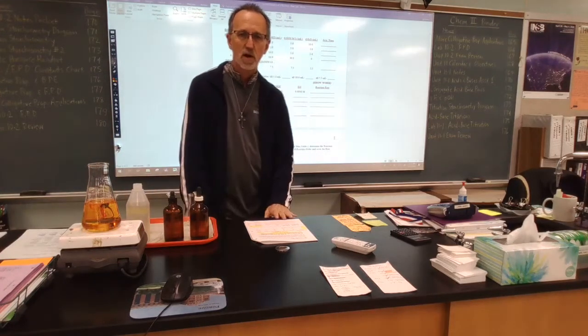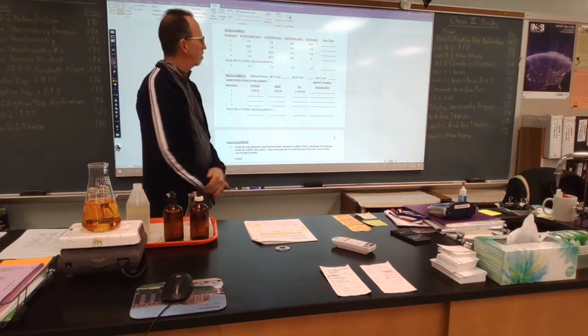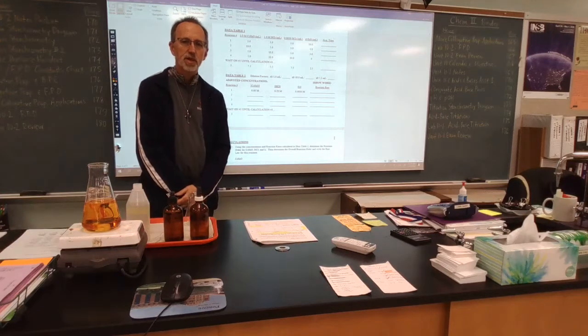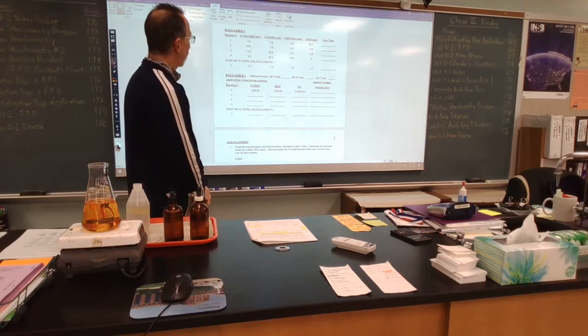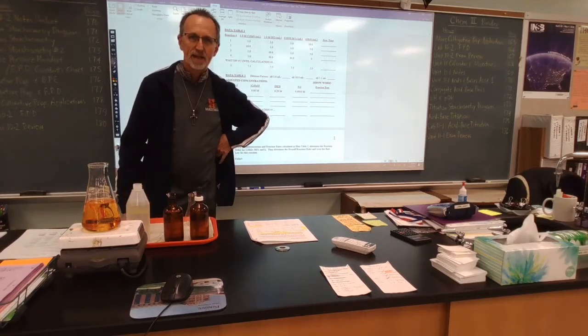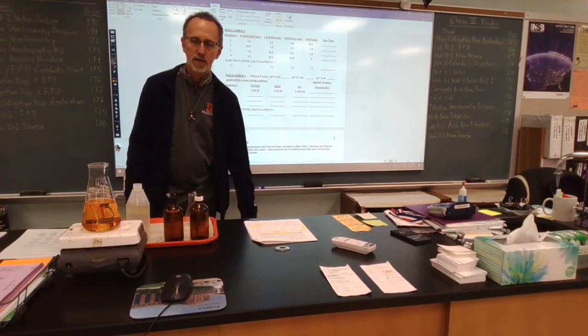to equalize the volume. So as you use volume, you can kind of see how we're laying this out so that we can determine the reaction order for each reactant. For instance, and I'm not jumping the gun, I just want you to be thinking about this as you finish up all the procedures.